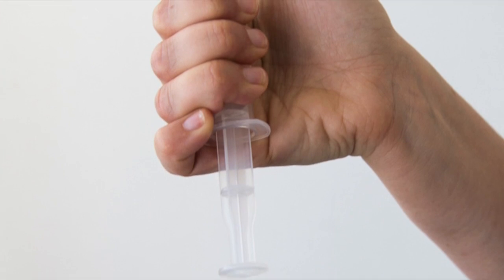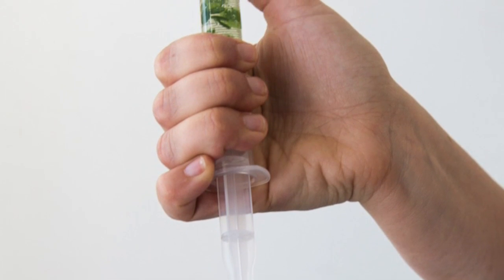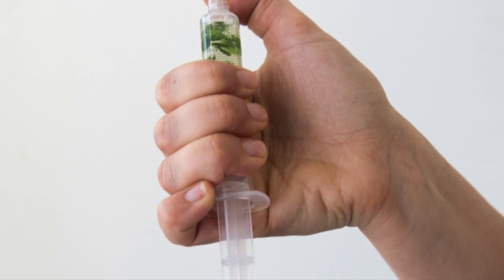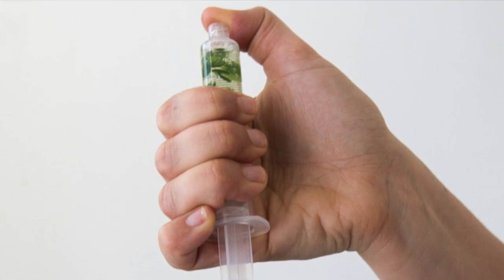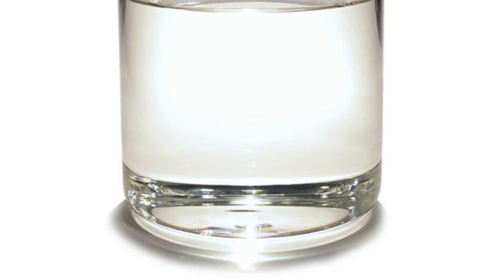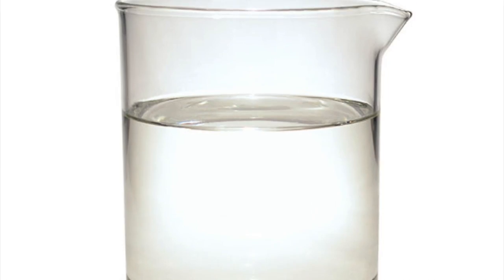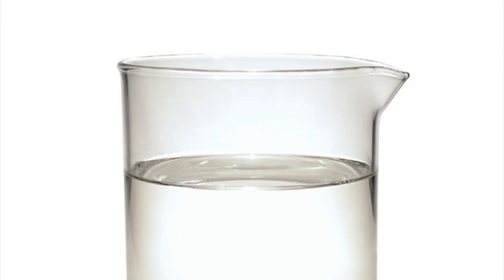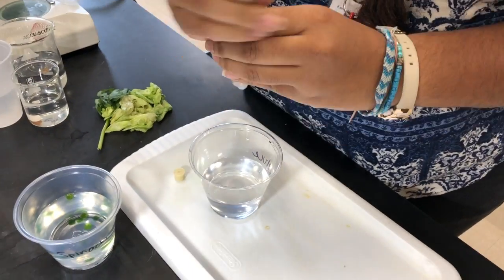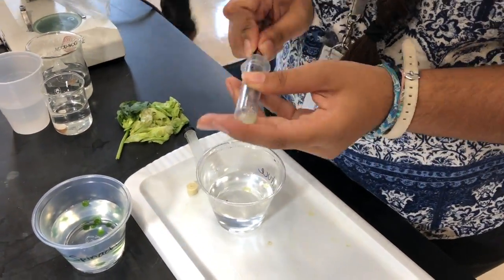Step 7. Release the vacuum, causing the leaf discs to sink. Repeat step 5 up to 3 times until all the discs sink. Repeat steps 4 through 6 for the lettuce. Step 8. Add fresh sodium bicarbonate solution to a clean 200 milliliter beaker to a depth of approximately 3 centimeters, and add the contents of the syringe labeled spinach to it. Repeat the process with lettuce.